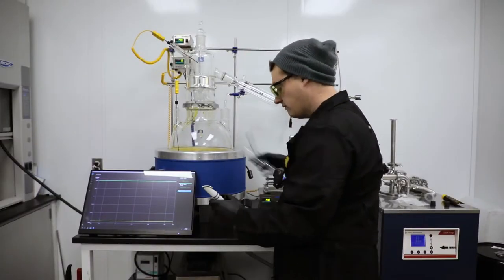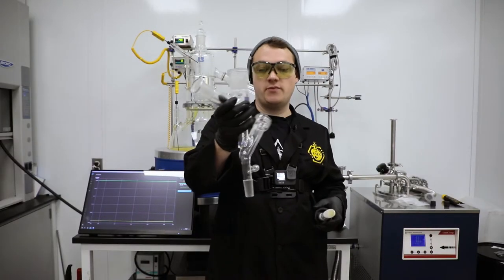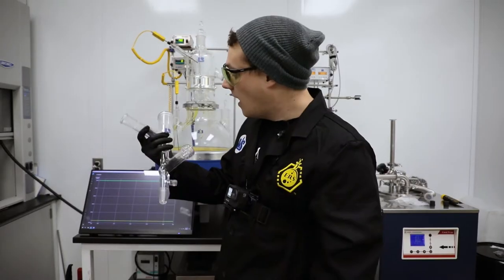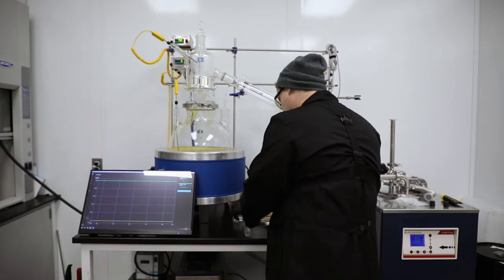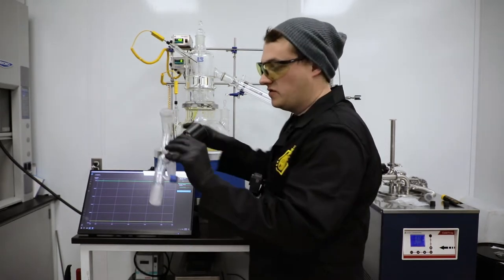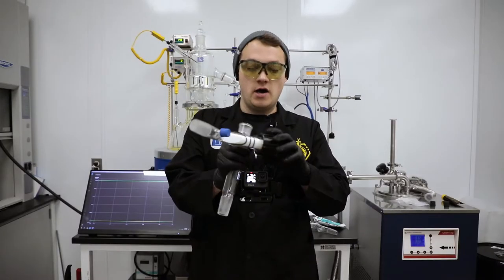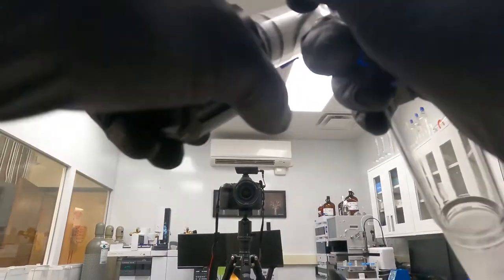I've got two different ones here. I've got the original prototype one that I've used countless times — as you can see, it's quite filthy and it's got the valve not inserted. This one has been used probably about six times and is the production model. You've got the GL14 on here, proper angle, and this one has not been cleaned yet.